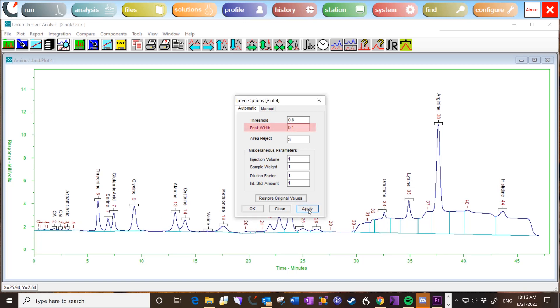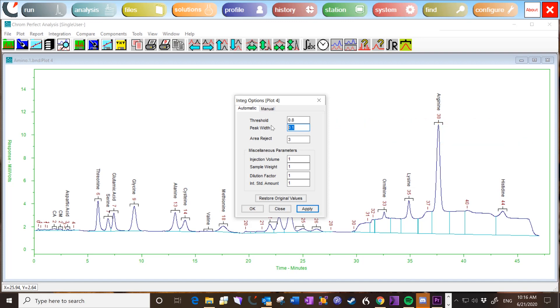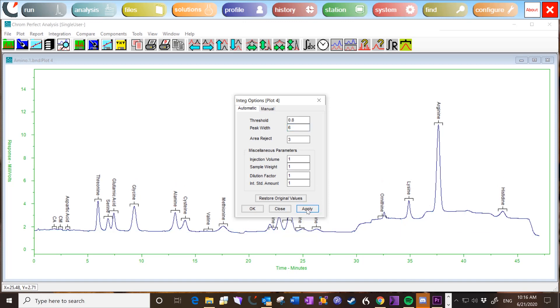The peak width setting tells the peak detection algorithm what peak width is expected. Enter the expected full width at half height for an early peak in minutes. Appropriate values are 0.01 through 0.10 for GC and 0.10 through 2.00 for LC. If the value is too large, then peaks may be missed. You can experiment with the peak width and threshold settings to find what values are most reliable.